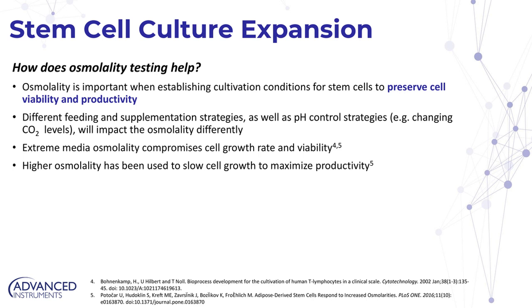We typically think of osmolality specifications as ensuring that cell viability and productivity are preserved. There have been a lot of studies so far that really highlight the benefits of increasing osmolality, and that plays into the same thing that I said with the media QC. Up to a certain extent, it may be possible to slow the growth and maximize the productivity as your cells are in culture. And developing a specification around this is really key.